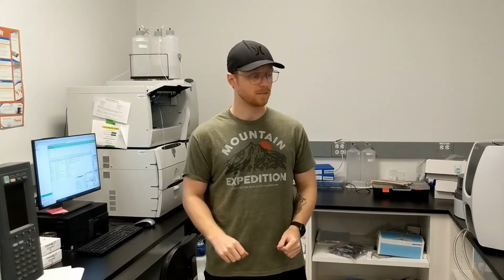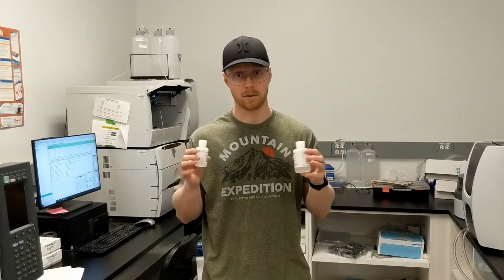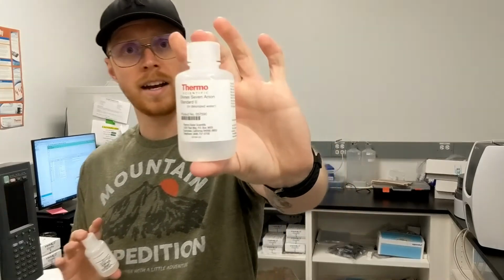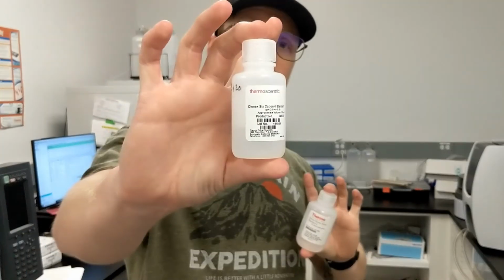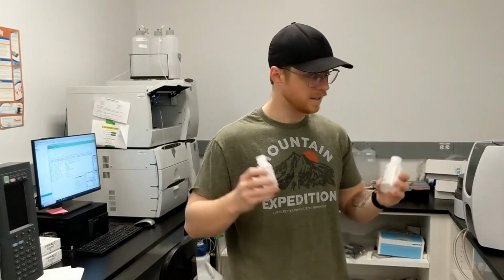Once your samples are in the right vials, you need to make a calibration curve. I'm not going to walk you through how to make dilutions and stuff. We should know C1V1 equals C2V2, but I will tell you that the easiest way to make a calibration curve if you're not making it from raw salts is by using these Dionex 7 anion standard and Dionex 6 cation standard. These have different concentrations of different ions in them, and you can really easily just dilute them to the values that you need.